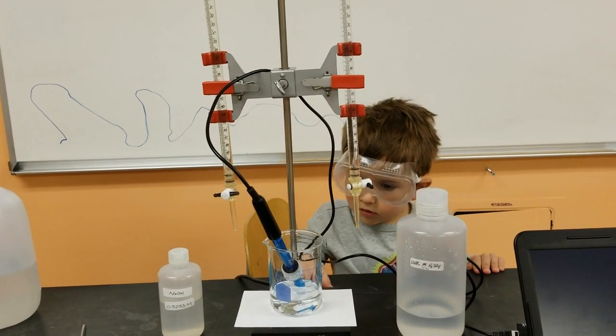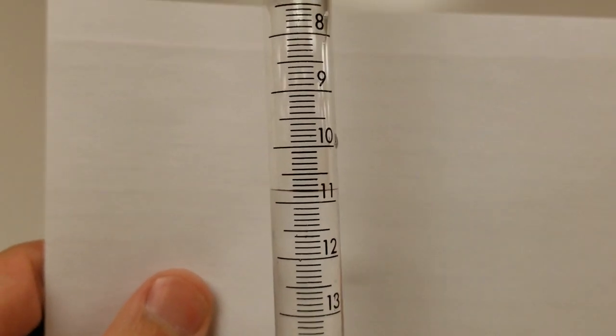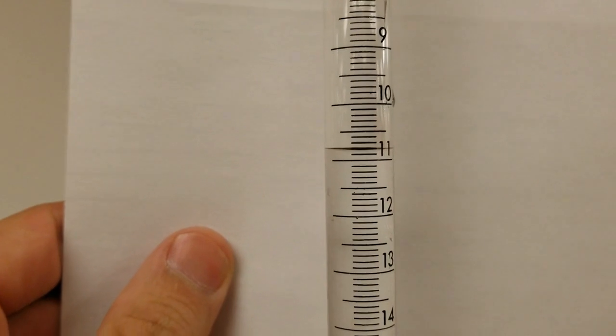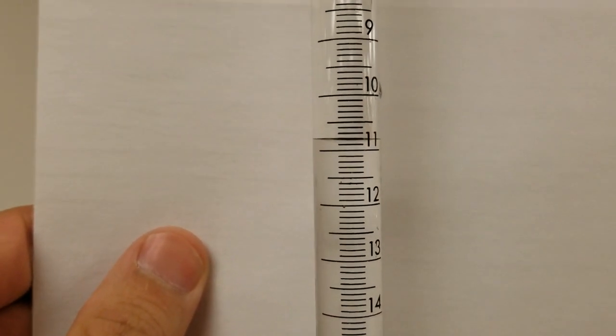Okay, so now I've put in some acid. This is where it ends up. So approximately 10.8, maybe 10.81, 10.80 milliliters of acid.